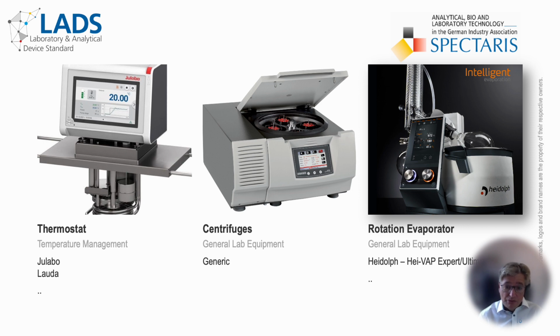The LADS proof of concept software provides an elaborated LADS information model and simulation for all types of laboratory centrifuges, one example shown in the center image. Speaking of elaborated LADS OPC UA information models, they are also available for rotary evaporators like the one shown on the right image.